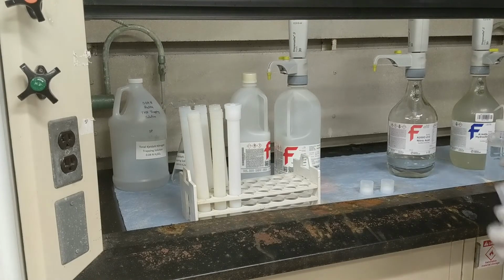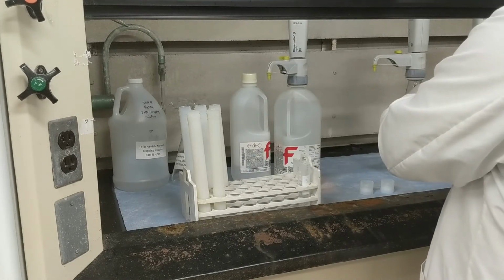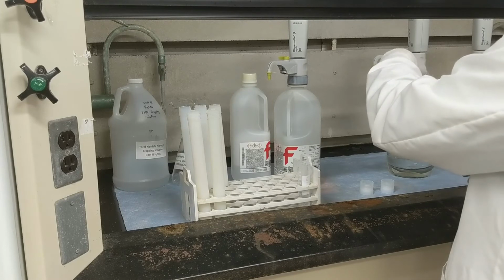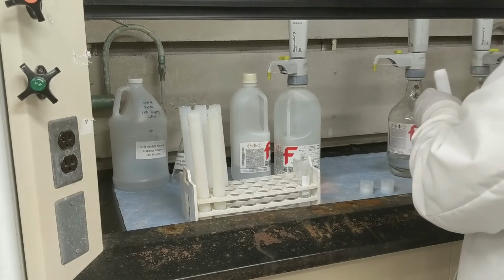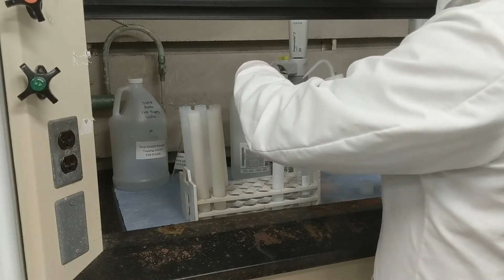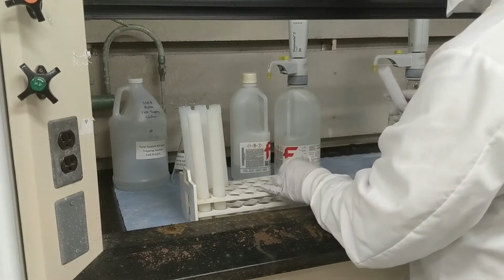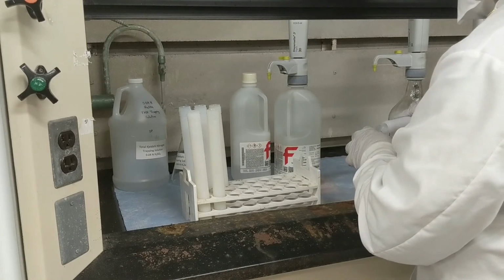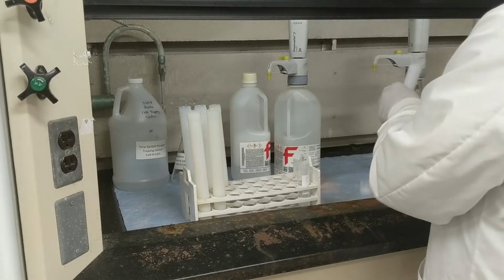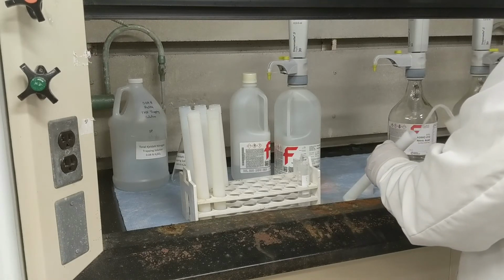For our ICP-MS samples, we generally want to work in plastic because the glassware can sometimes leach elements that our ICP-MS picks up. So the pour is actually easier. Same process of rinsing down the stopper into the vessel, but then pouring into a wide mouth 50 milliliter plastic centrifuge tube is quicker and easier than a narrow-necked volumetric flask.